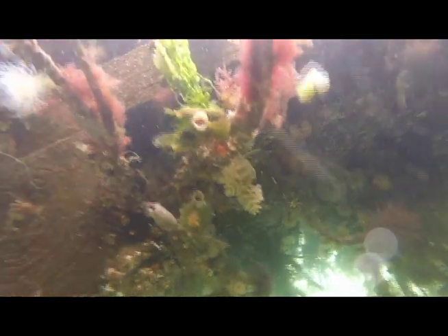Measuring turbidity gives us an indication of the water clarity. For the Puget Sound, turbidity is a great way to assess how much primary production or plankton might be present in the water.